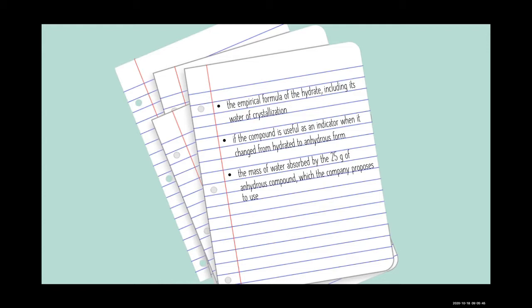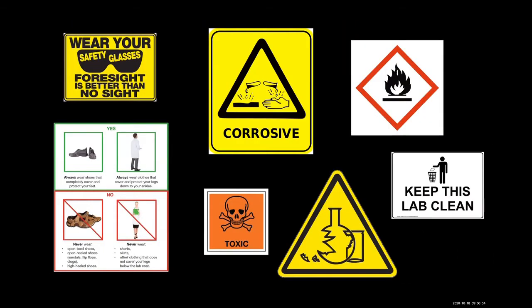Even if you can guess what the formula for the hydrate should be, carefully perform this lab so that you know how well your company's supply of CuSO4 absorbs the moisture. Remember your lab safety precautions.